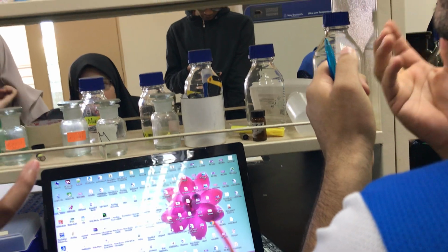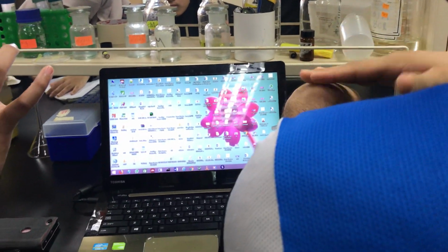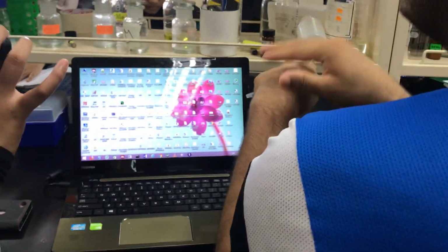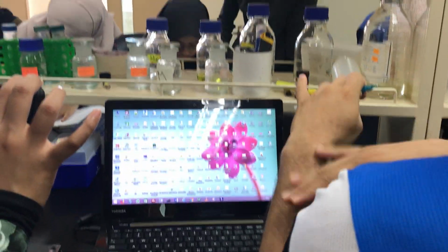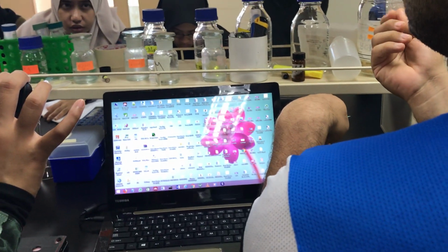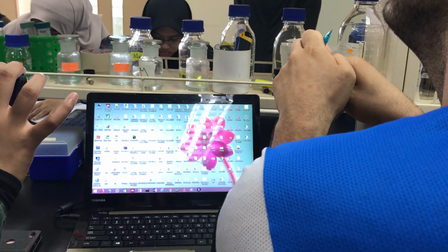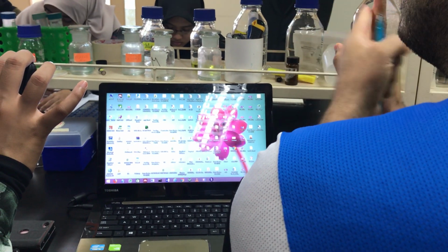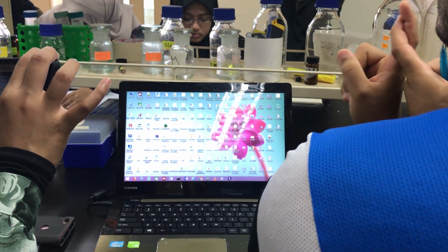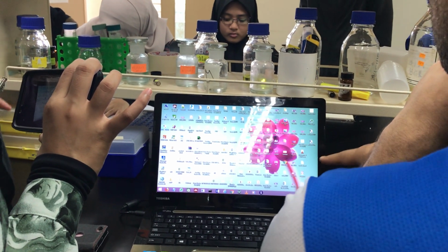If the factory wants to predict, usually antioxidant is used for creams. Most of the creams, they will say this is antioxidant activity. It is very good for the skin. Mostly they show antioxidant activity. Okay, that's why we use FTIR for quality control. Only for quality control. Most of you use this software. This is a model.